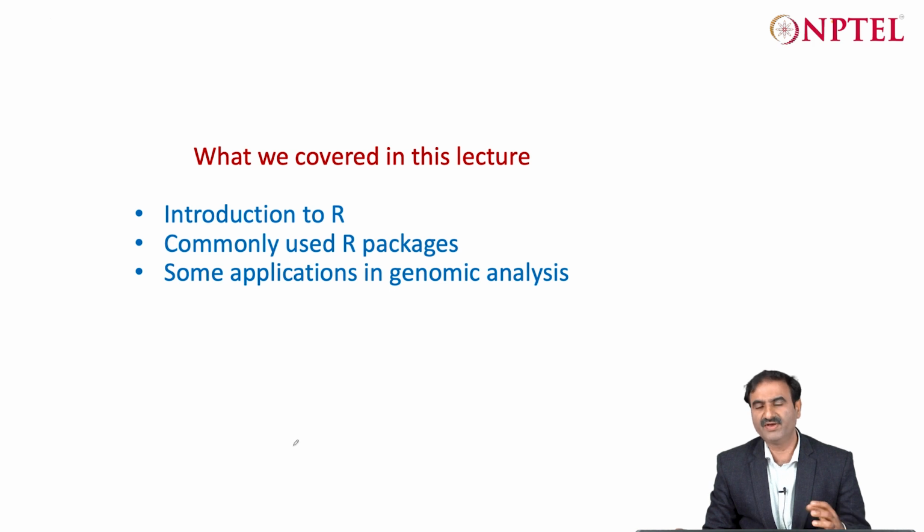Along with R, these three things will help you to prepare your system and get familiar with the tools and packages, and the installation is generally similar for either R or Linux, because generally the same type of installation procedure is used by different developers. So all these three will help you in running the codes or programs that we will be looking at in the later part of the lectures, including genomic analysis, metagenomic analysis, or epigenomics.